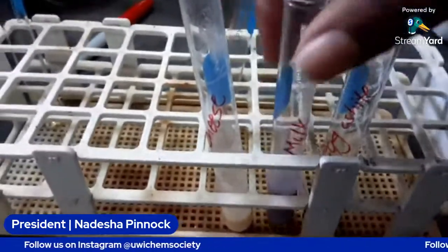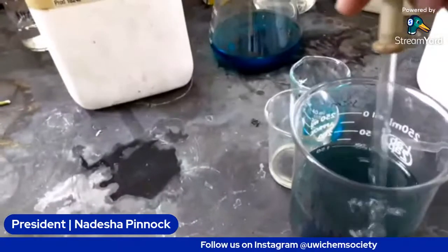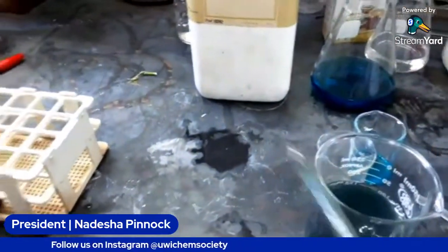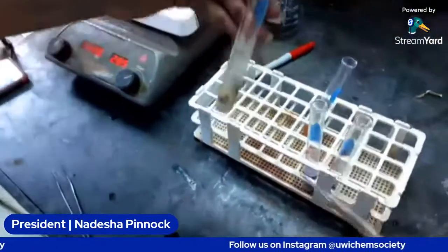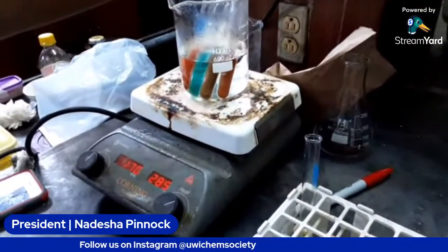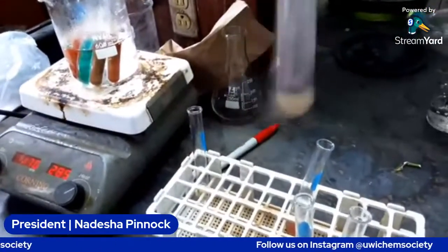So then we're going to do the cheese. So we're going to add it to the cheese. As you can see, almost instantly you're seeing the color changing.